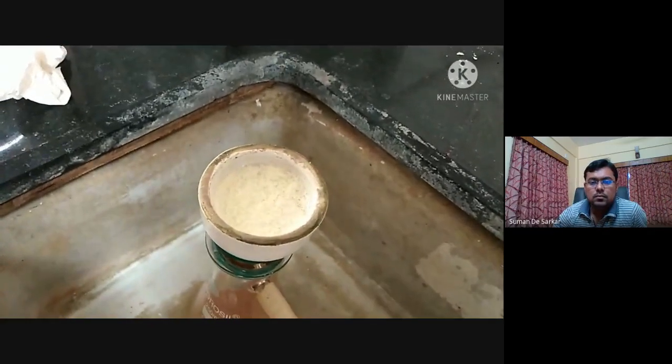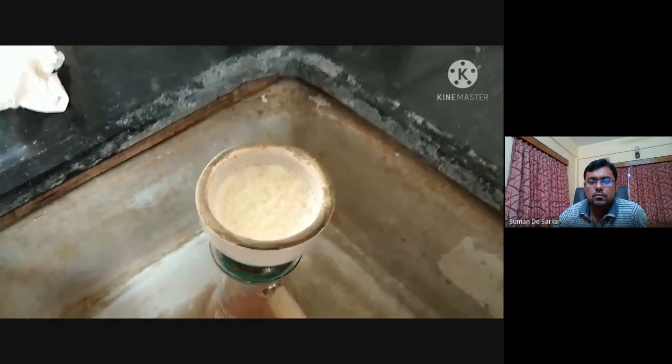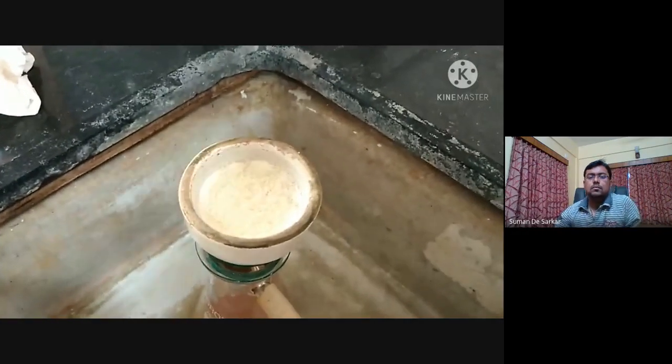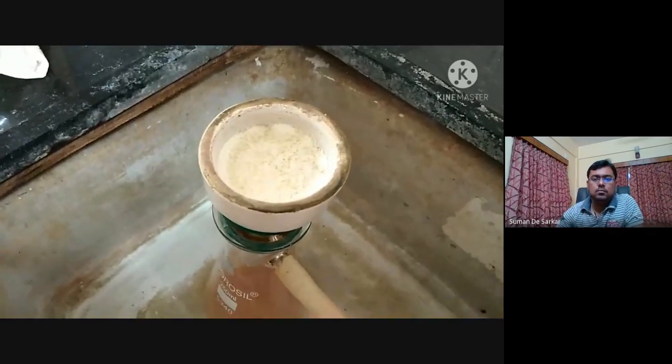Fine particles there, that's why probably the filtration is a bit slow, but we'll just wait for a few more minutes. Sucks all the water. You can already see very nice product precipitate is coming out.